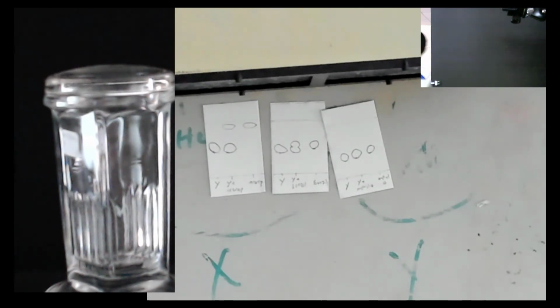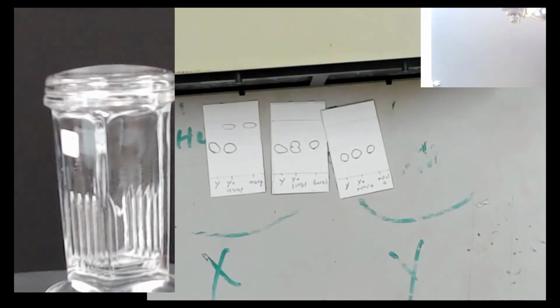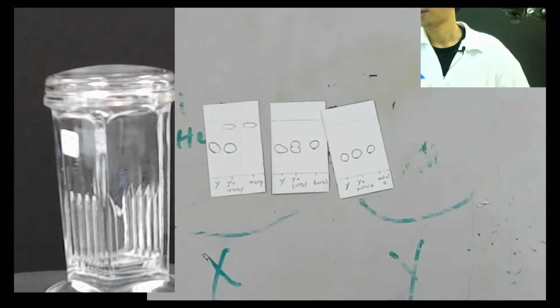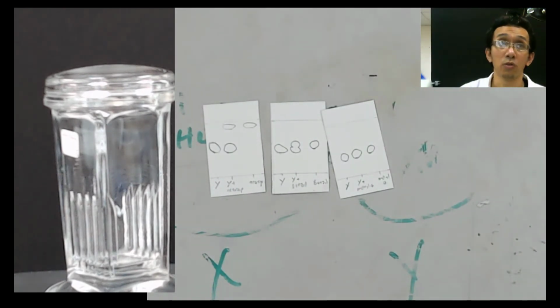Wait, I will open the light. Okay, so that is light on, and then we move this UV over there.